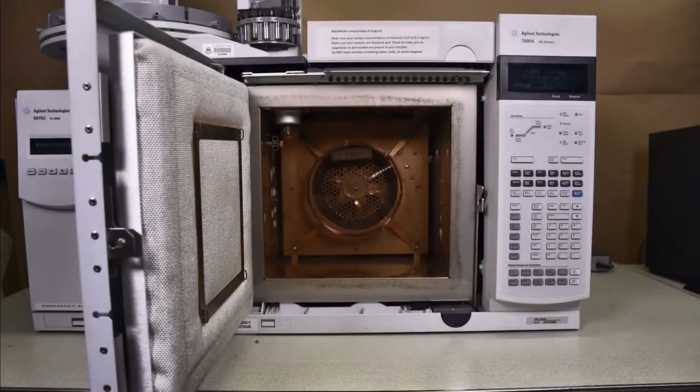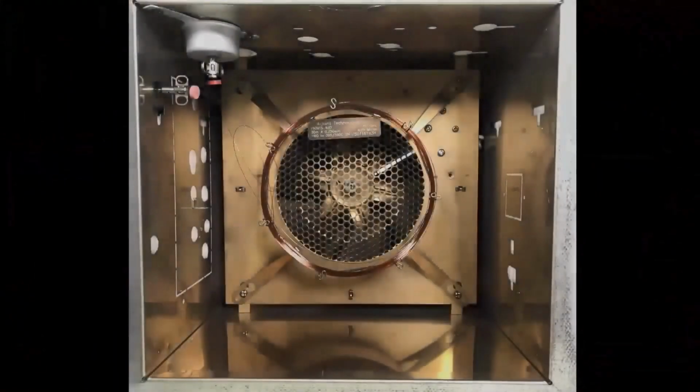The oven and column are the most important part of any GC. The insulated door must be closed when the GC is on. The oven keeps the column at the required temperature.